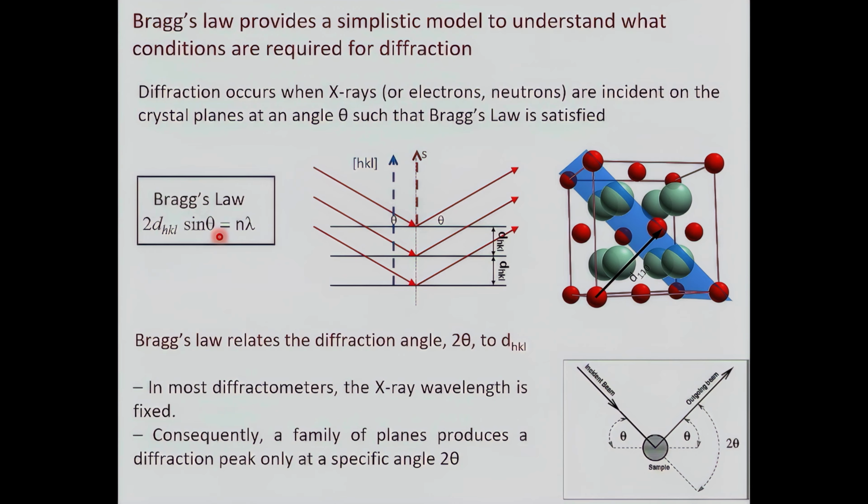Then I repeat, theta is the angle or the orientation of your plane, which must satisfy the Bragg condition, and then give you diffracted beams that constructively interfere, and then give you a resulting signal that can be collected by the diffractometer and give you what we want, your signal.